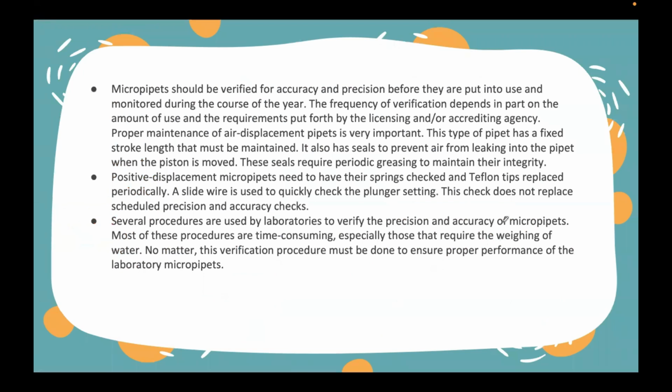So micropipettes should be verified for accuracy and precision before they are put into use and monitored during the course of the year. The frequency of verification depends in part on the amount of use and the requirements put forth by the licensing or accrediting agency. So ang ating mga micropipettes, they are not just a simple equipment that are used in the laboratory. They still need yung preventive maintenance. So kung iniisip nyo yung mga malalaking machine lang sa lab yung ginagamitan ng preventive maintenance, yung kina-quality control, mali po kayo dyan. Even yung mga micropipettes po natin, monitored po yan ng mga medtech.